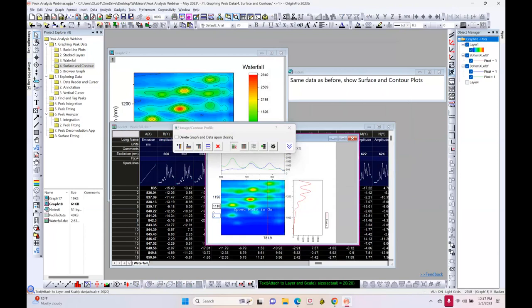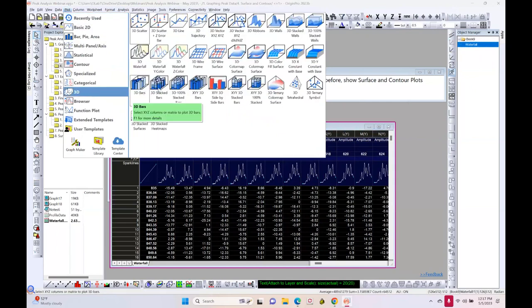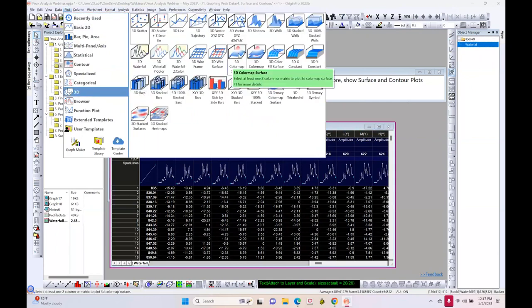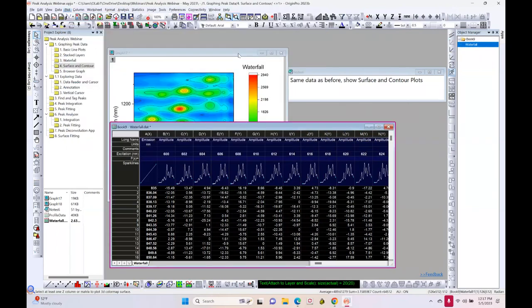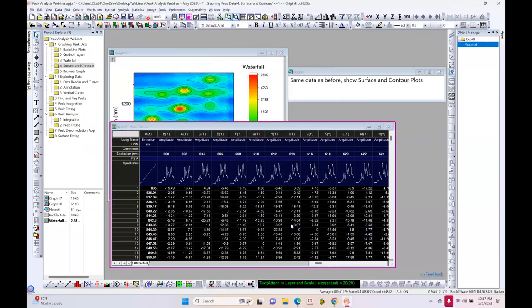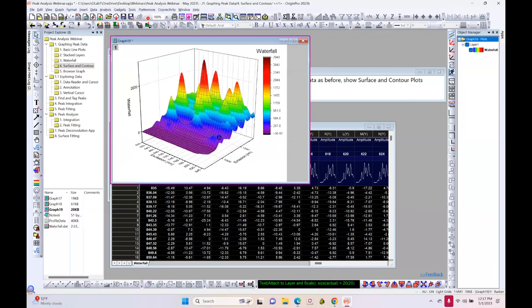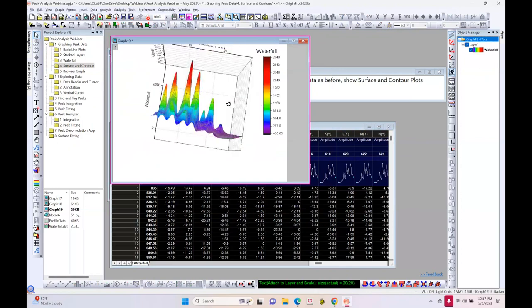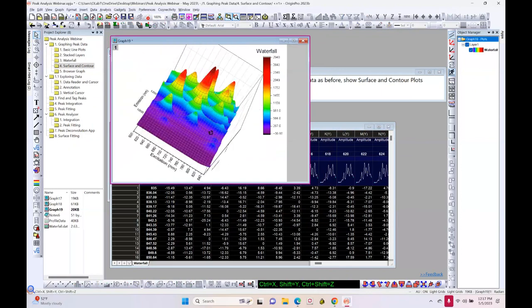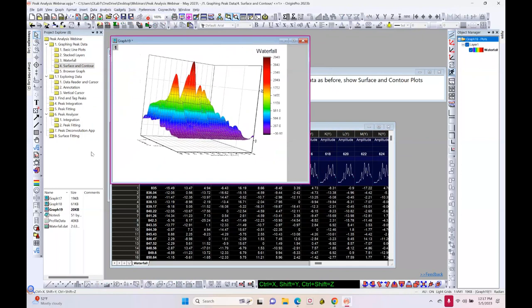With the same data, let's go to the plot menu under 3D and choose 3D color map surface. Again the virtual matrix dialog pops up. Using the same settings, I now get a 3D surface plot of the data.